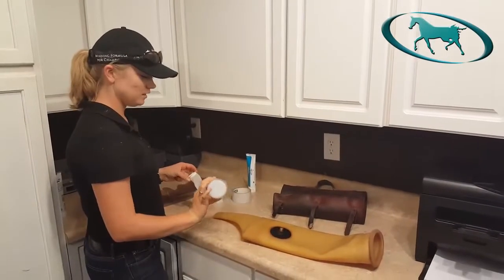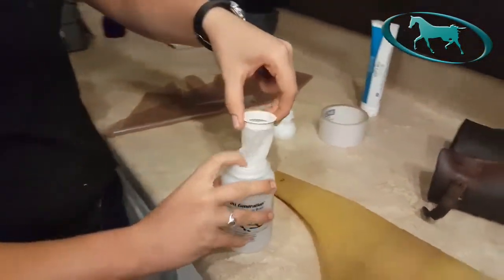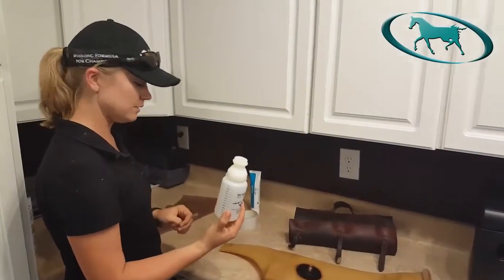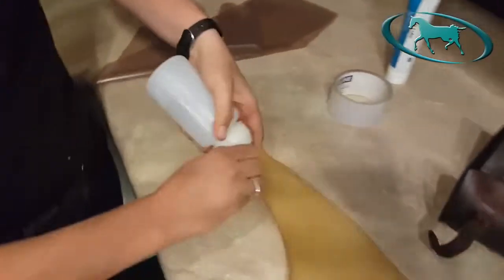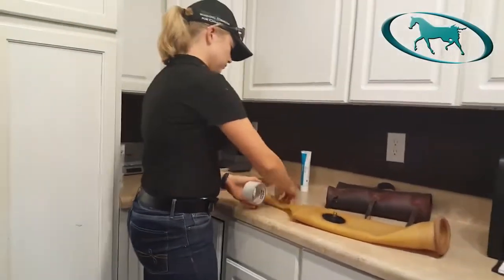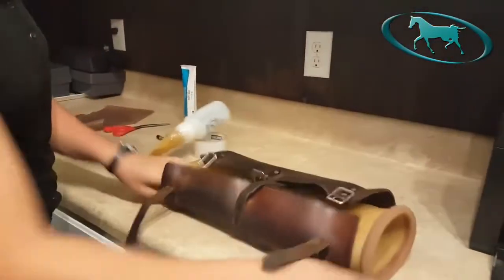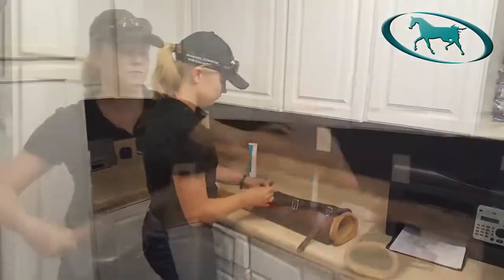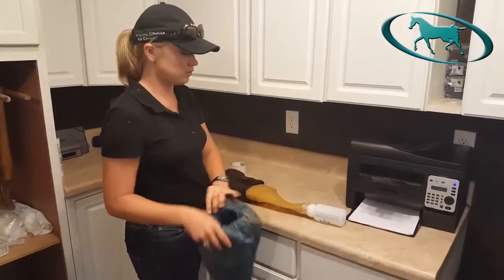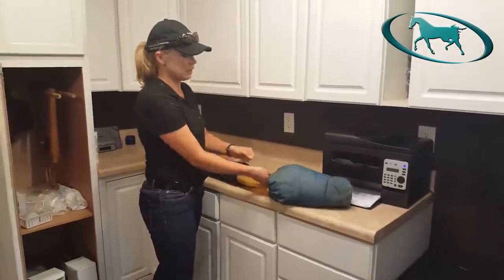I put the baby bottle liner in the cup, then I put the filter — this will catch the gel fraction of the semen — and it goes in the baby bottle liner. I put the cup on the bottle, and this is what catches the semen. It attaches to our bladder like so. This is the insulated bag that goes over the semen collection bottle, and this keeps the semen protected from light and temperature shocks before we can process it in the lab.